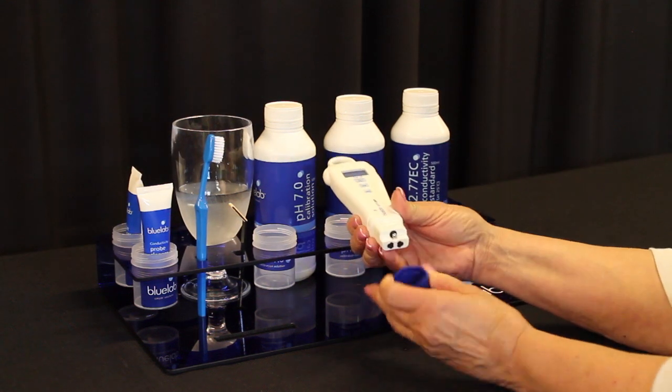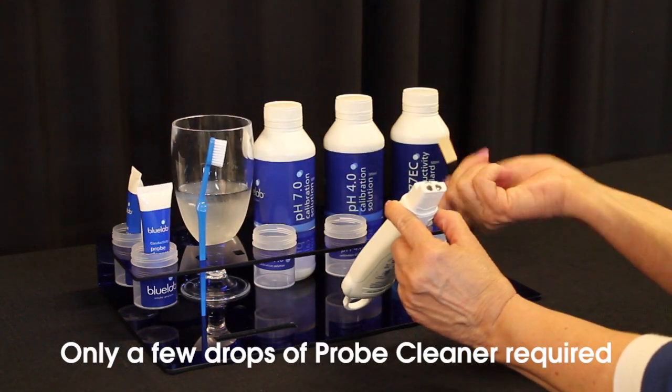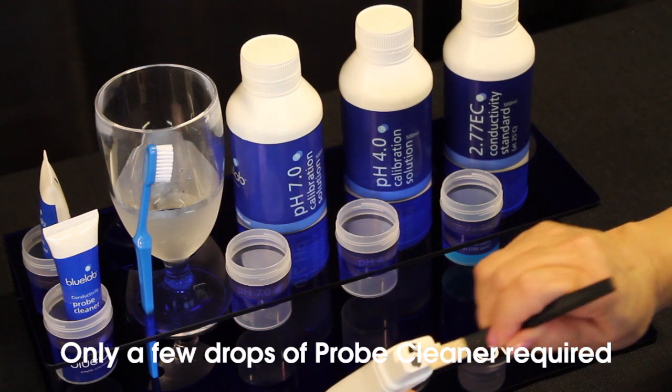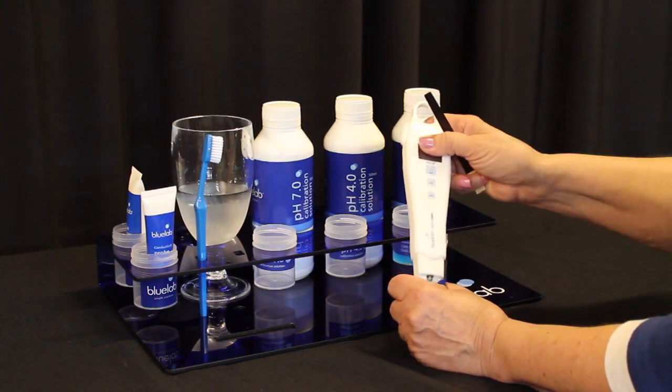To clean your pen, use Bluelab conductivity cleaning solution. Remove the shroud, clean the face of the probe, and rinse off all traces of soap under running water. If really dirty, this step may need to be repeated.